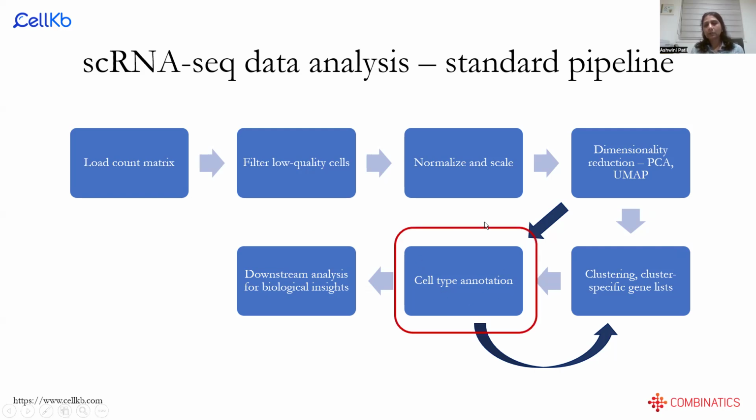And that is the reason this is actually a big bottleneck, because you have to go through multiple rounds of doing this, and for each round you may need a different reference to do this annotation.